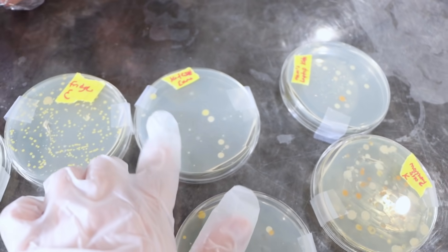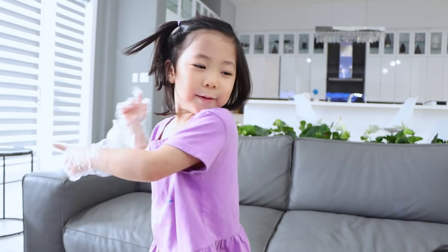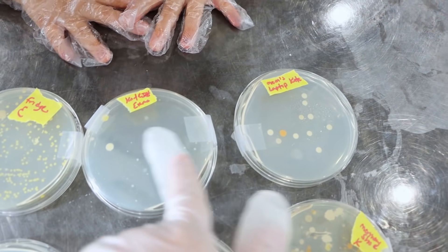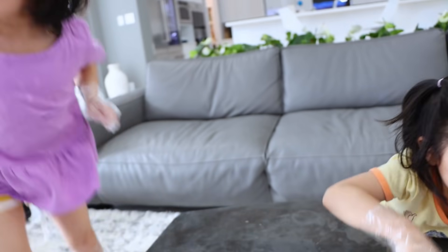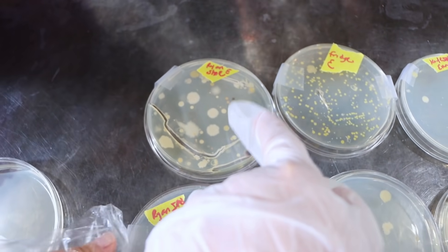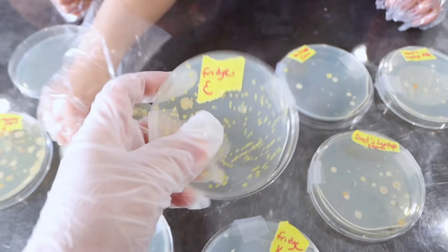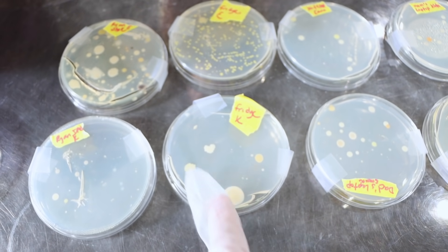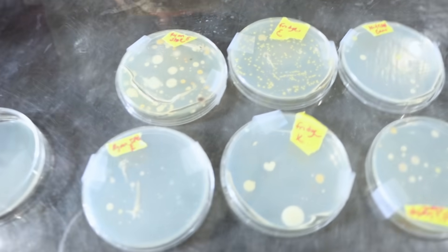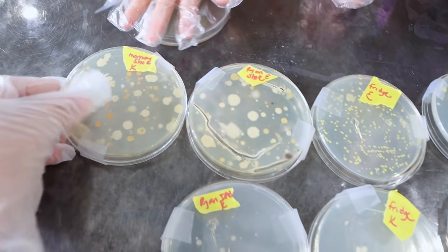This one is not a lot — this is from Kate's iPad. Not that much, Kate. Good job. Your iPad was pretty clean, but a little bit dirty. And this is for Mommy's iPad. Mommy's iPad and Kate's iPad — it is a lot of bacteria, so we need to keep it clean. Yeah, you did do my iPad! And this is Ryan's iPad. Oh, Ryan's iPad is dirty, but it doesn't have as much bacteria as Ryan's shoes — Ryan's shoe is a lot more. Do you see this tiny little one? That's the fridge — the fridge is tiny but with a lot of small colonies. Look, that's a big colony of bacteria right there. Do you see it? Mommy, are the germs alive in there? Yes, these are all alive germs that are growing and multiplying and dividing. So this one is from Daddy's laptop. Mommy's shoe and Ryan's shoe is almost the same — it's super dirty.